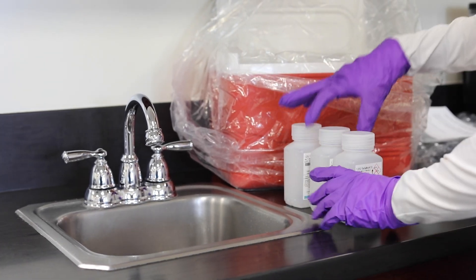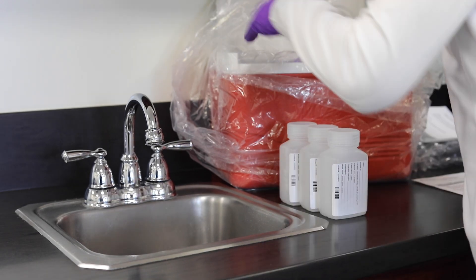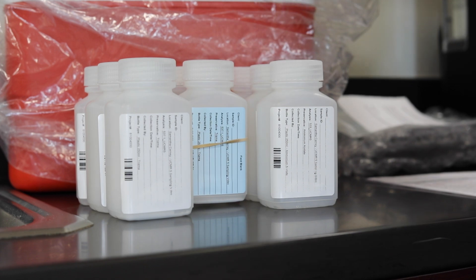To avoid confusion, it's a good idea to organize the sampling bottles prior to collection. It's important to remember that bottles may contain chemical preservatives, so avoid skin contact.